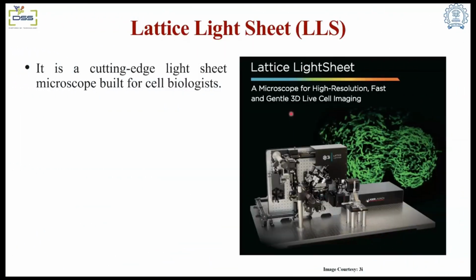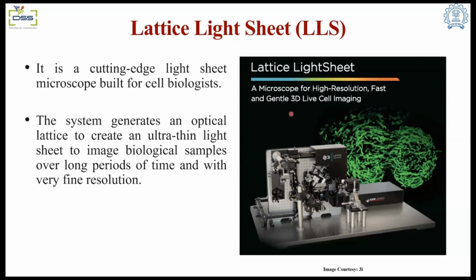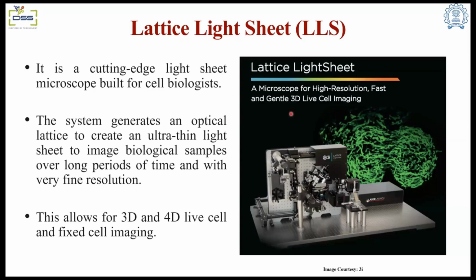The lattice light sheet microscopy is a cutting-edge microscope which is built for the cell biologist. The system generates an optical lattice to create an ultra-thin light sheet to image biological samples over a long period of time and with very fine resolution. This microscope allows for 3D and 4D live cell as well as fixed cell imaging.